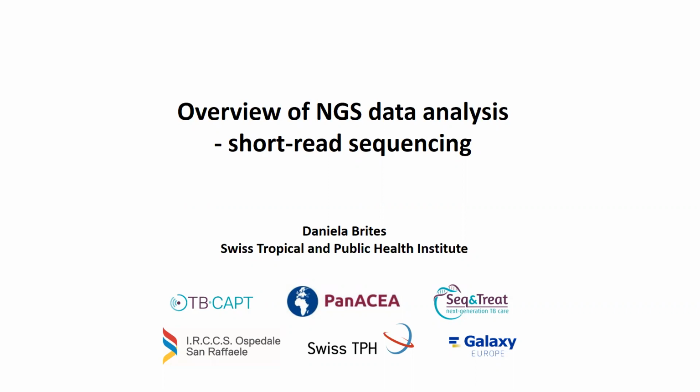I would like to welcome you to this webinar in which I will go over the main bioinformatics steps associated with short-read sequencing, giving some emphasis on aspects which are important in the analysis of Mycobacterium tuberculosis complex sequences.